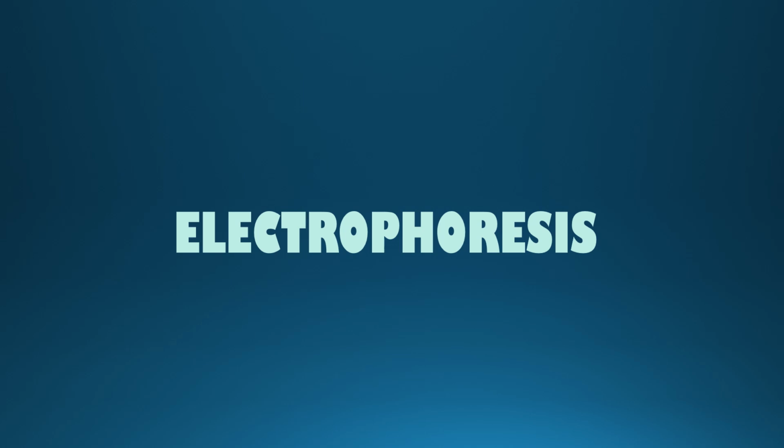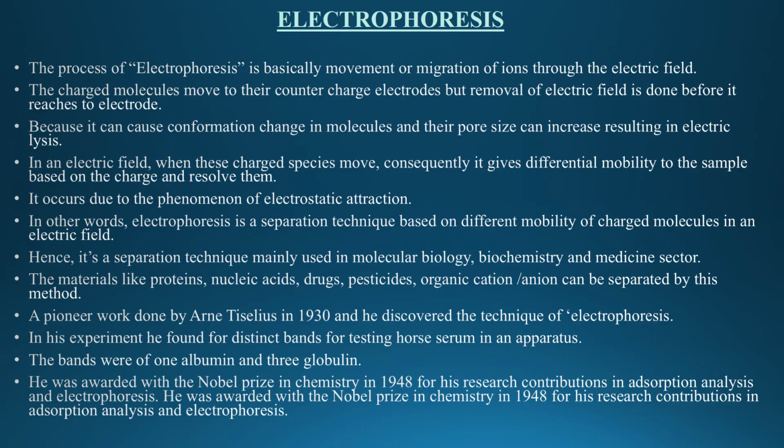Electrophoresis. The process of electrophoresis is basically movement or migration of ions through the electric field.